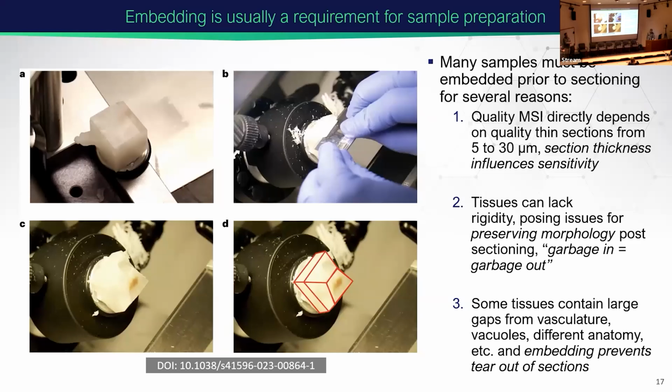So you can imagine that maybe from a bigger sample you can get more material, but all those techniques are mostly surface techniques. So we don't actually go down to the bottom of the sample.